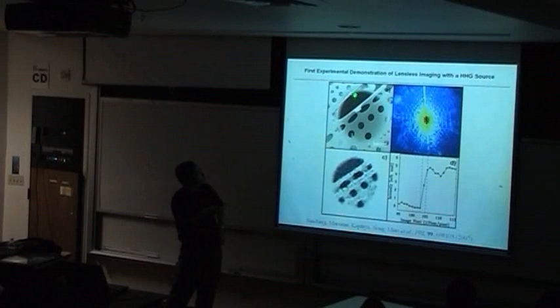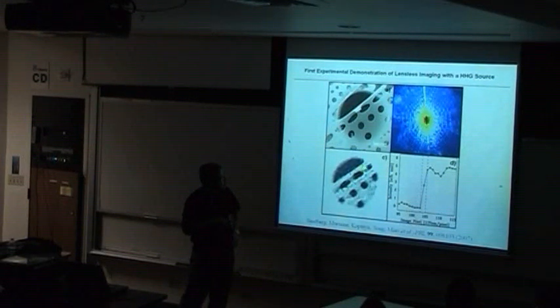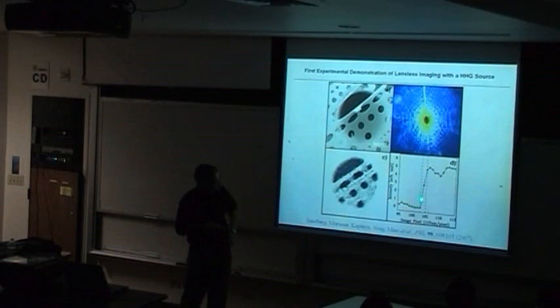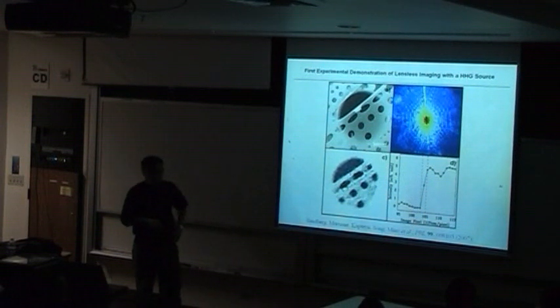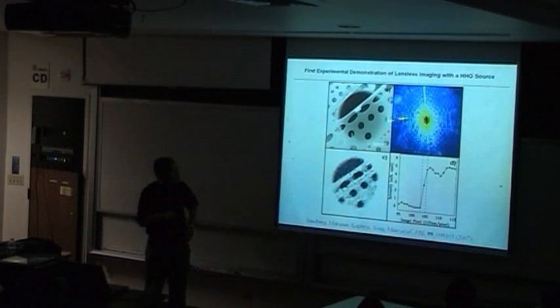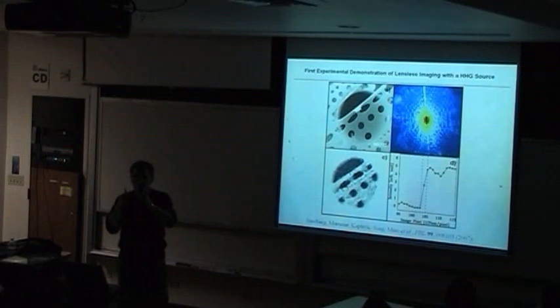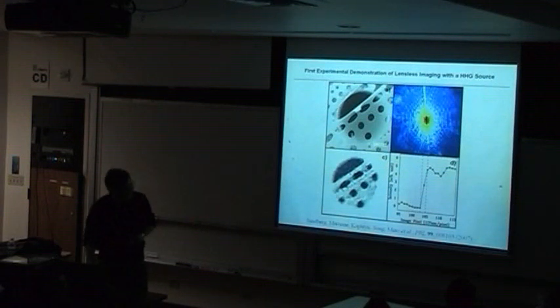We have a mesh put on a pinhole, and this diffraction pattern. From this diffraction pattern, we reconstruct and do a line scan, and the resolution is about 200 nanometers. Now we can do much better, but this was just the first demonstration experiment. And recently the French group did a single shot experiment, and Margaret and I even wrote a news article for Nature on that.